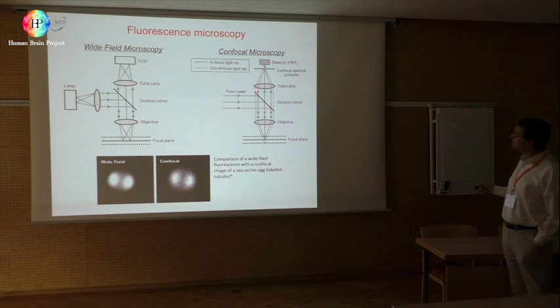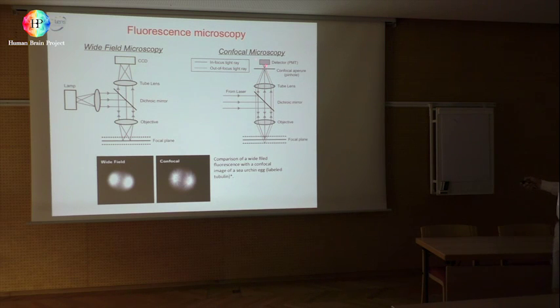Confocal microscopy uses an optical filter, a spatial filter, a pinhole, so that all the photons coming from out of the plane are rejected by this pinhole. In fact, as you know from the principles of optics, if the focus is the plane of imaging, it's in the focus of this objective, then the wavefront is plane, and then it's imaged in this pinhole.